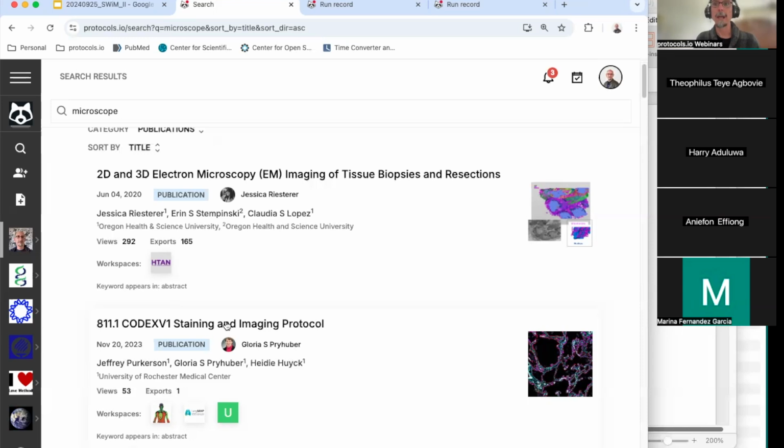Yeah, you can do that. The only caveat is that you might have to type the protocol yourself. If you have the protocol in a Word format, I showed you that you can import the steps semi-automatically by copying them and pasting them into the insert steps from text function. But if the protocol is a PDF, you might need to retype it. That's the only caveat.